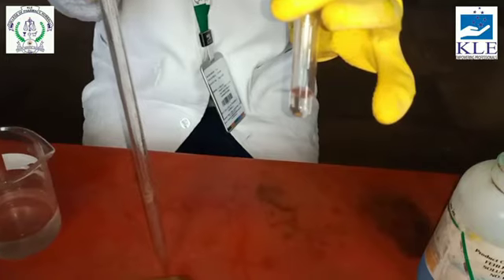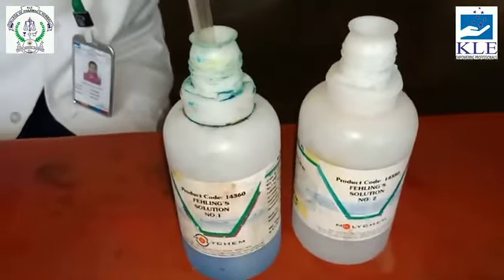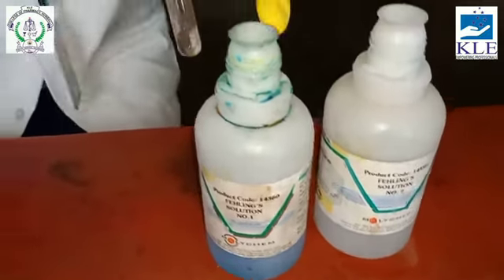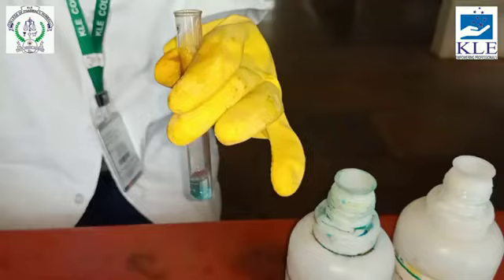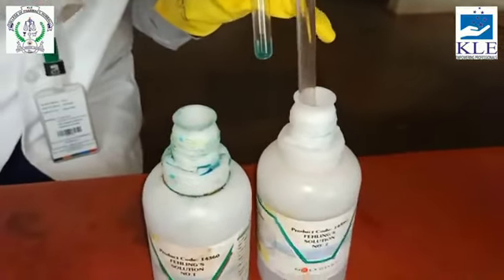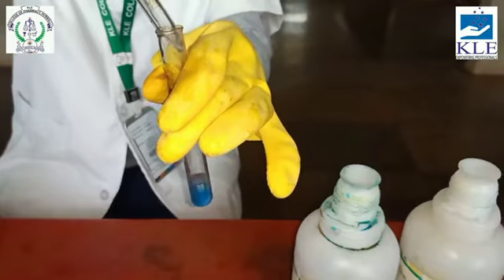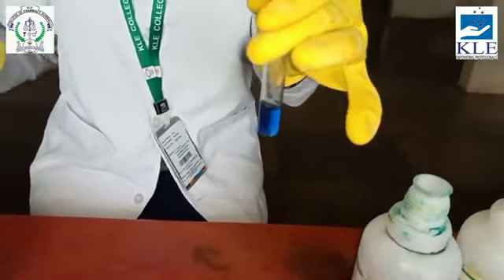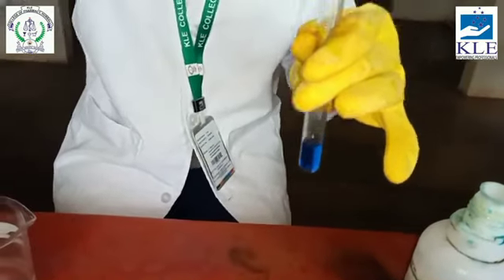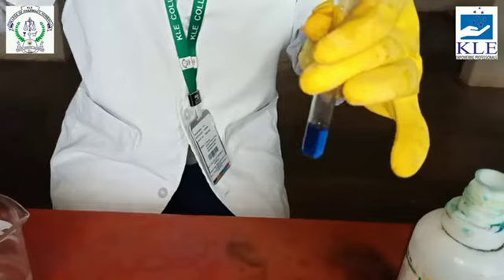We will be taking 2 ml each of Fehling's A and Fehling's B solution, plus 1 ml of the test solution, and we will boil it for 2 minutes and let it cool.